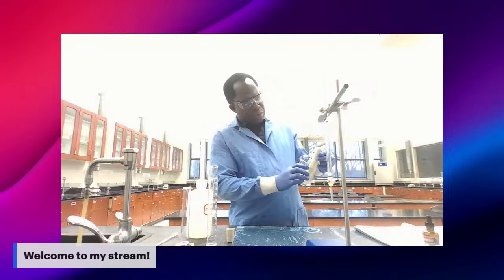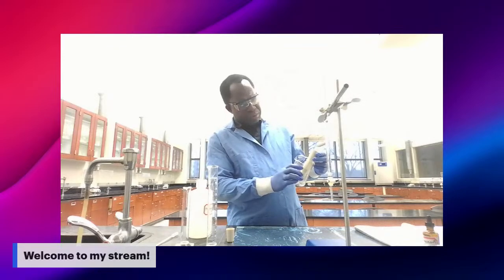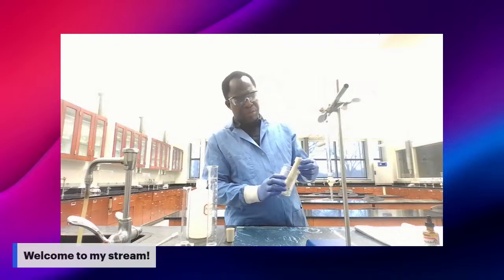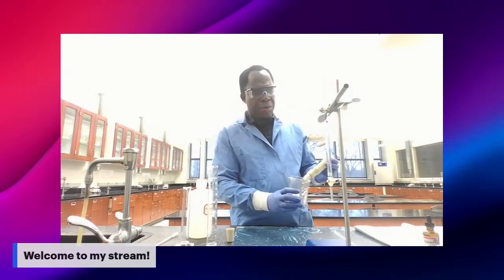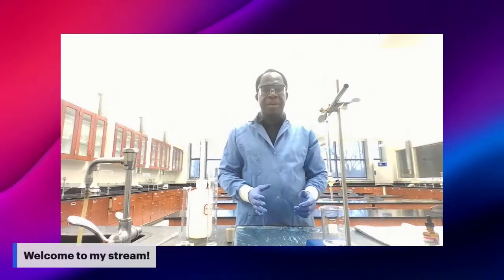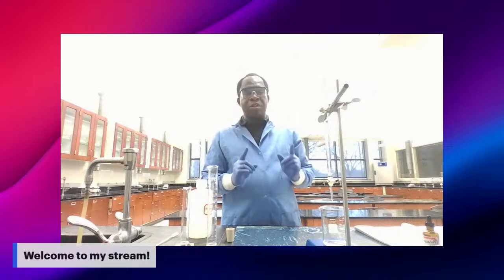Now my pH jumped from 3.4 to 3.5, and I have 3.4, 3.5 before a jump to 3.8. Okay, 3.8. So now this is how you're going to proceed, until you get a color change.